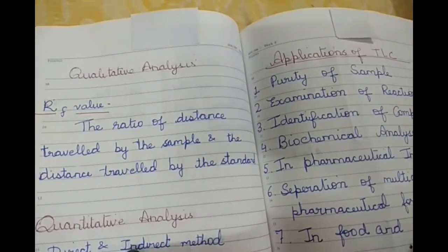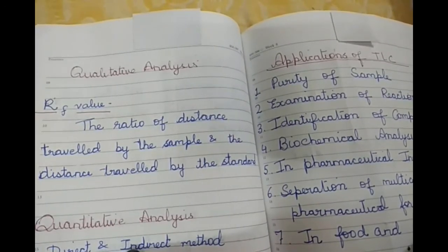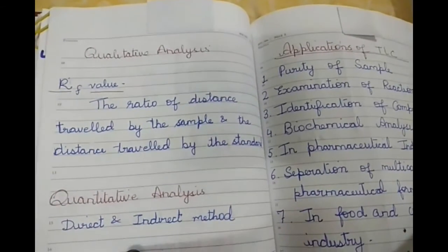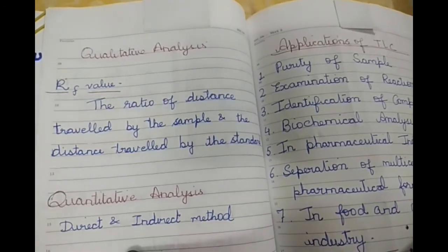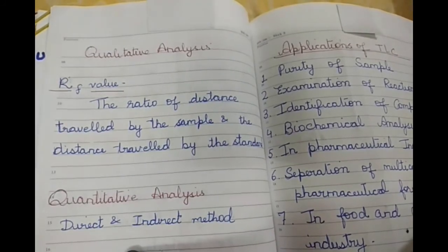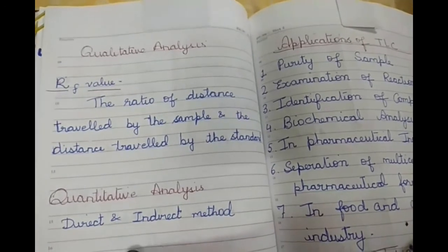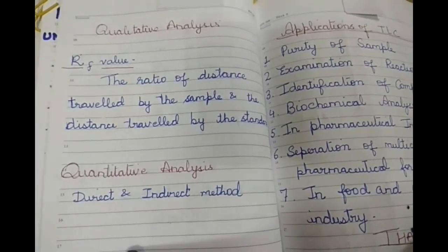So in the specific methods, we have spray reagents or detecting agents or visualizing agents, same as the paper chromatography. Now the qualitative analysis, the RF value. The ratio of distance travelled by the sample and the distance travelled by the standard is the RF value. The quantitative analysis involves direct and indirect method.